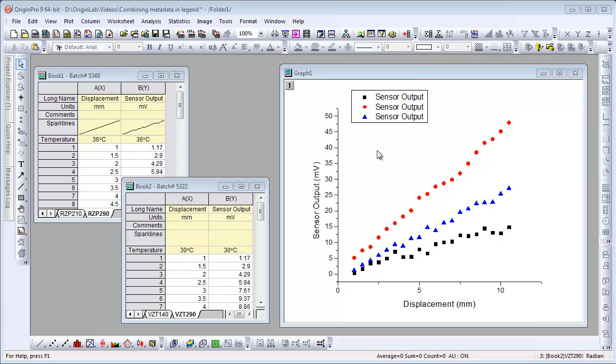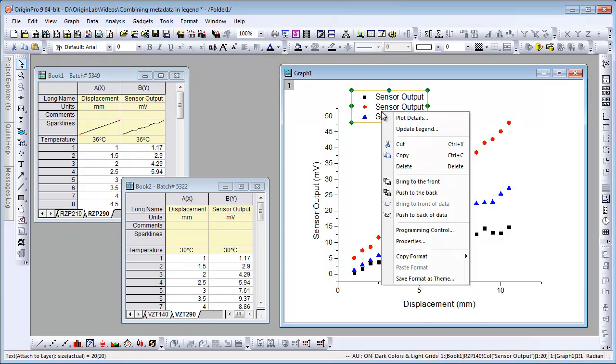If we look at our graph we've plotted three data plots here. The legend is showing the long name for each column which happens to be the same. So let's modify our legend. To do that we can right click on it and choose update legend.